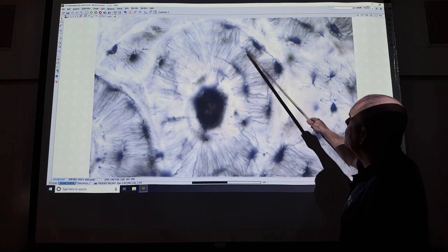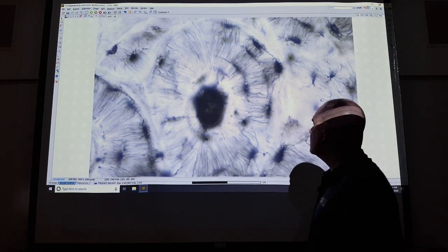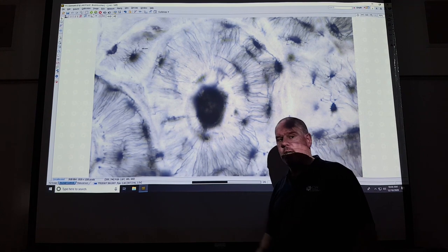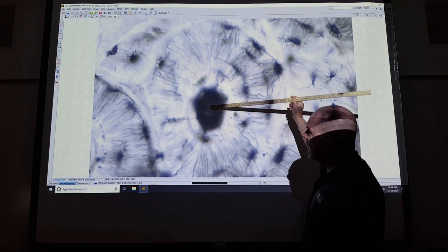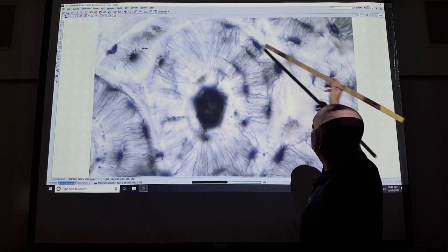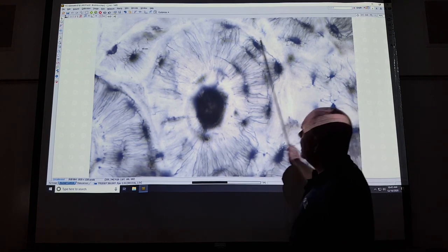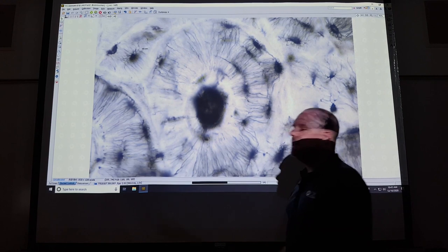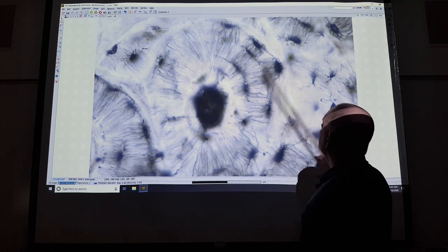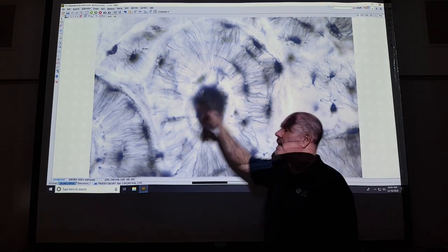These little spots you see here, which technically are lacunae, chambers where connective tissue cells once lived, this is where the osteocytes would be located. So on your lab quiz, if I point at the bullseye, central canal. If I point at these chambers within the rings of the bone, osteocytes. This is where we find the bone cells, osteocytes. And the entire target is called an osteon. Osteon is the entire target. Osteocytes would live here in these chambers, and central canal is the bullseye of the target.